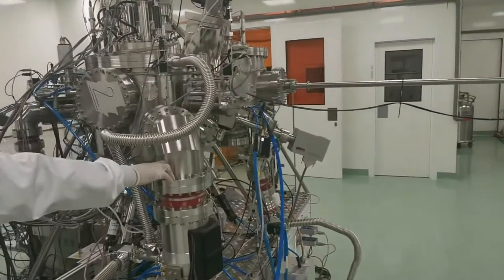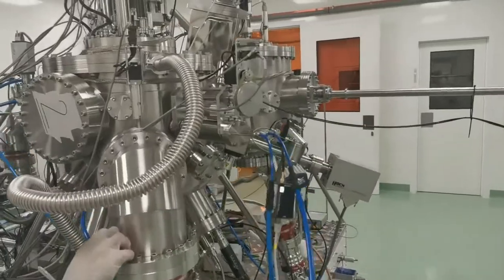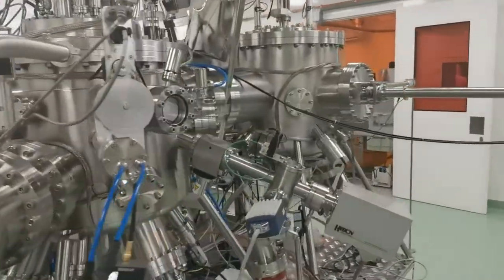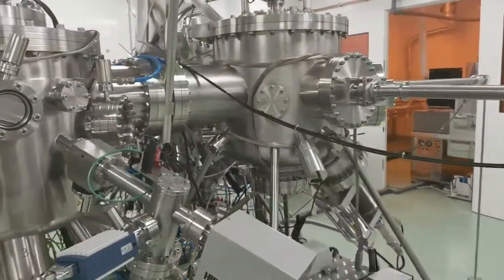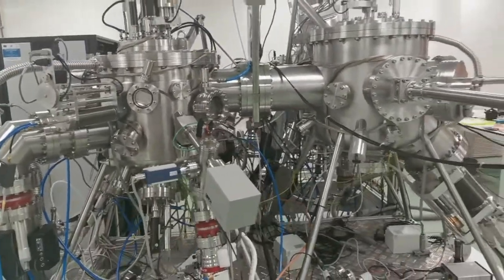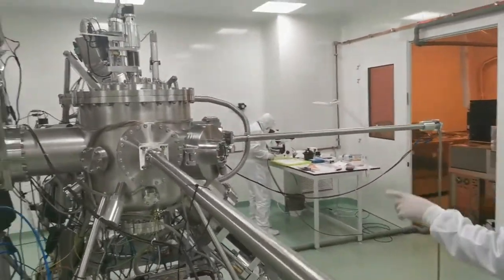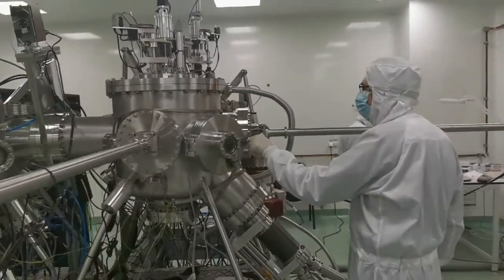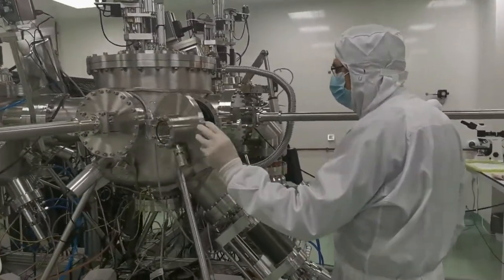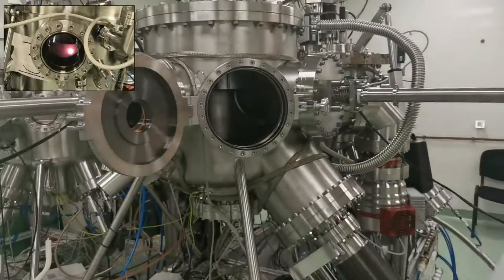The fabrication room houses two main deposition systems. The first of these is a custom-made ultra-high vacuum RF or DC sputtering deposition tool, dedicated to the fabrication of ultra-thin and thin nanometer films, as well as thick micrometer films, using metals, oxides, nitrides, alloys, nanoparticles, and hybrid structures such as multilayers.